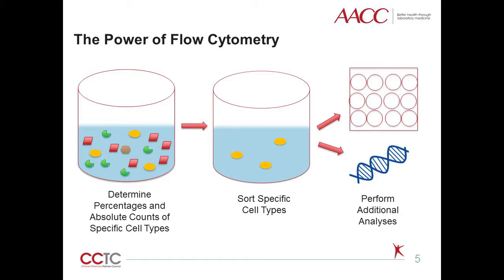With specialized cytometers called sorters, viable sterile cells can also be sorted based on these parameters and collected in order to perform additional analyses. I often explain flow using a vegetable soup analogy. You could analyze your soup and find out that vegetables account for 15% of the total. Or, with flow, you could analyze your soup and find out that 15% is vegetables, of which 5% is celery, 3% is carrot, 1% is beans, and 6% is red pepper.